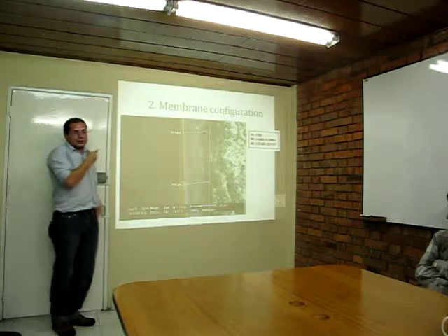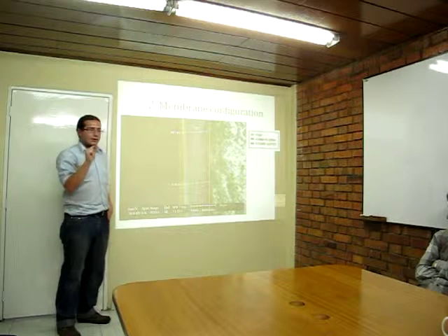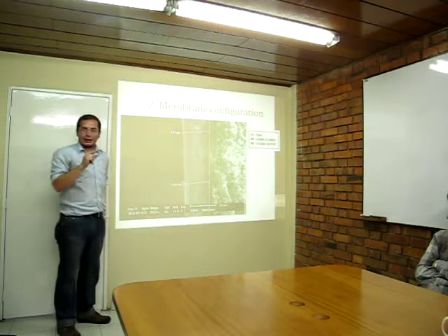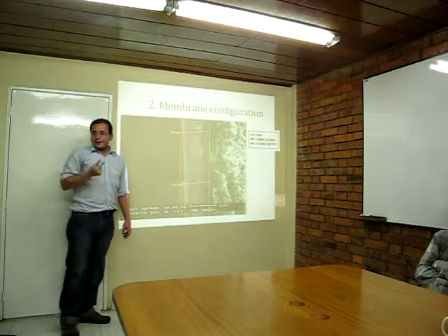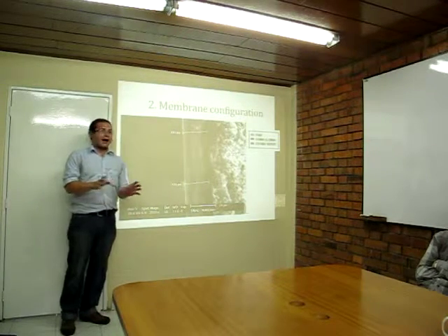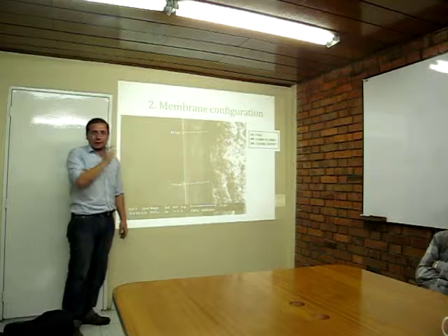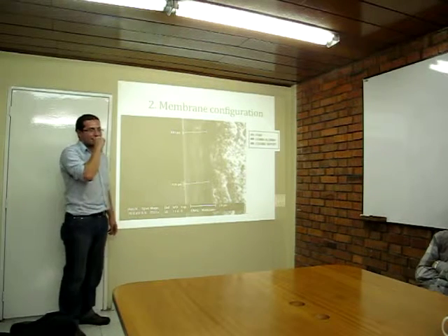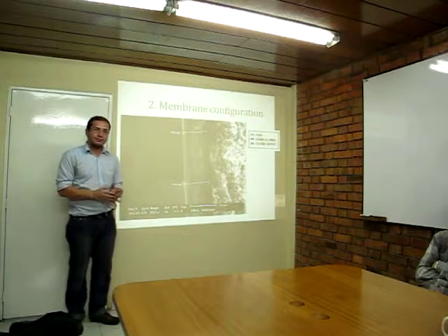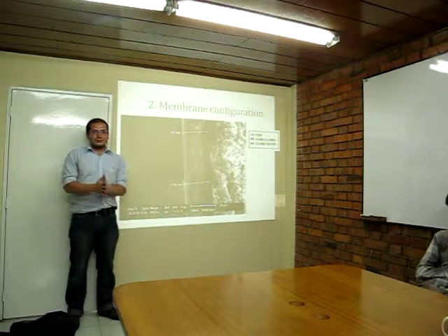But in this work we manufacture membranes with a thickness of nanometers, and the SEM cannot see this membrane. We know that we have a membrane because we have a separation of ethanol and water, but we cannot see the membrane. We can see the gamma alumina. So the only test is, does it work or not? You can't test it in any way before you put it to work.